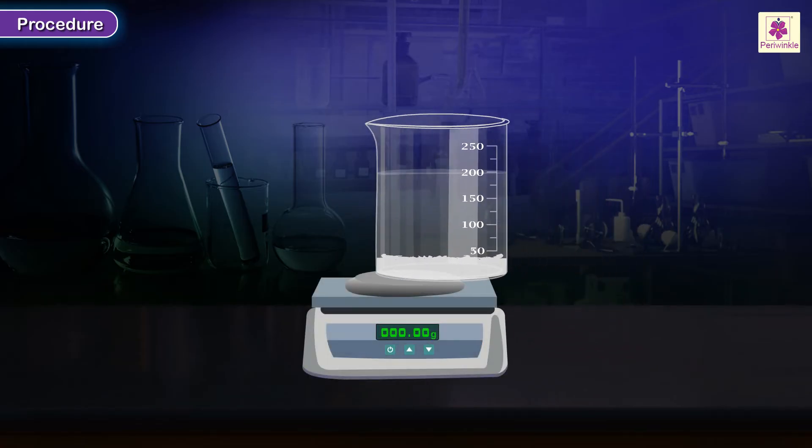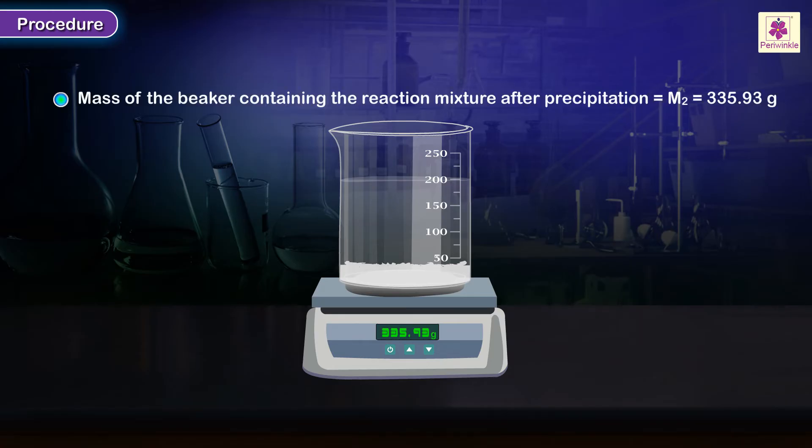Weigh the beaker containing the reaction mixture. Let this mass be M2. Mass of the beaker containing the reaction mixture after precipitation is equal to M2.